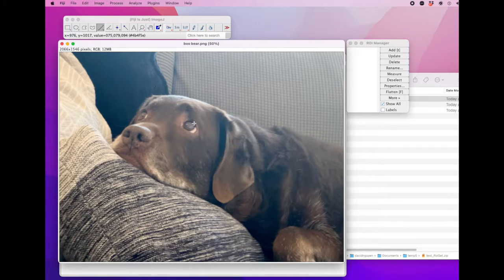Say you want to study dogs, right? The shape of dog eyes. And you take a picture of all of them in the same position, looking up to the upper left-hand corner of the image. And say for some reason you'd like to measure the shape of dog eyes when they're laying in this very specific position. And you have 1,000 of these images, okay?